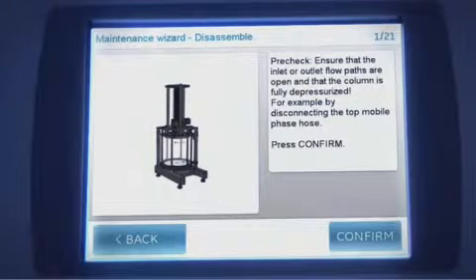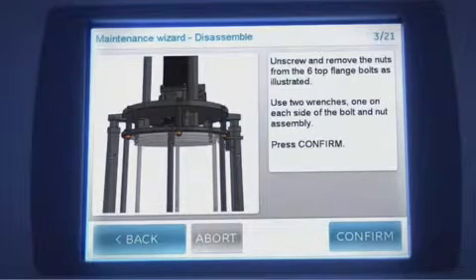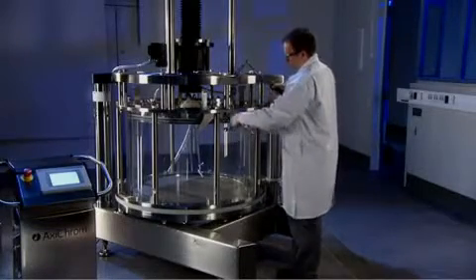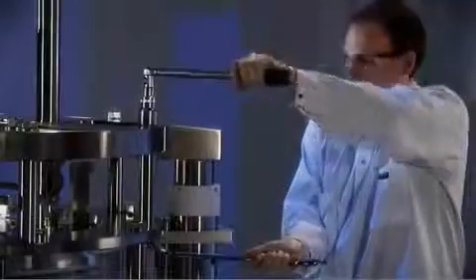The AxiChrome Master provides guidance on the actions to carry out through both text and illustrations. For example, which nuts and bolts to loosen or when and where to move the locking pins.